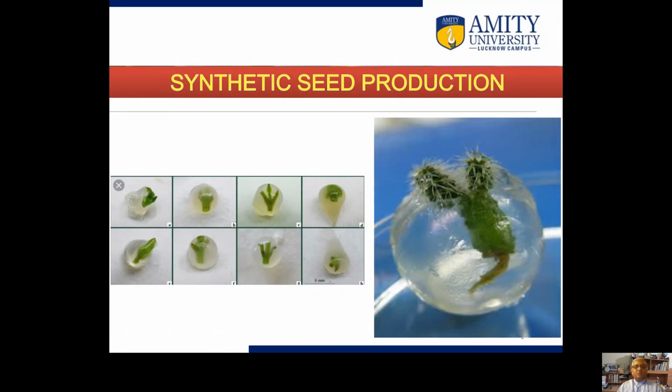So welcome learners in this session on synthetic seed technology. In this video tutorial, we will talk about what is synthetic seed technology, a technology which is considered to be an alternative approach for clonal propagation to avoid heterozygosity. We will also discuss how one can synthesize synthetic seed in laboratory condition and also its application.